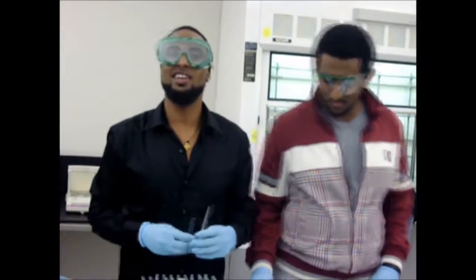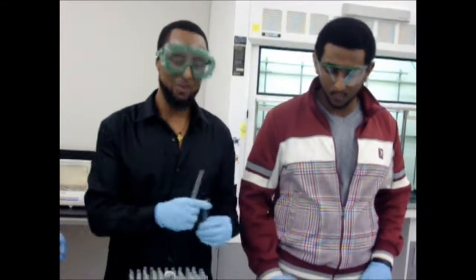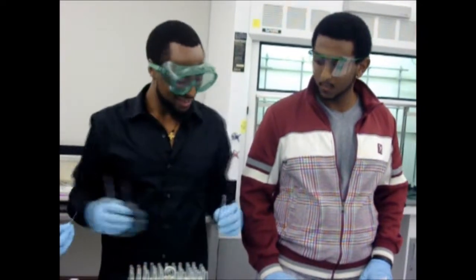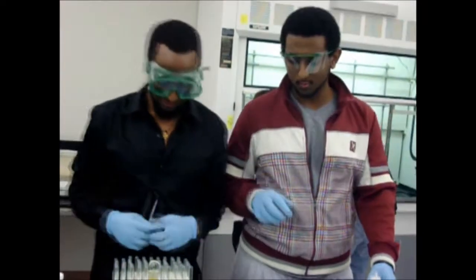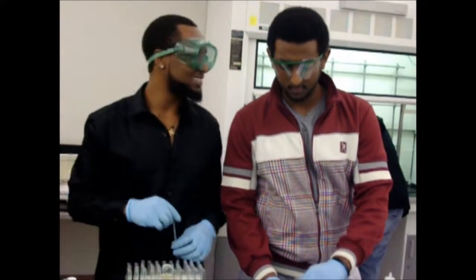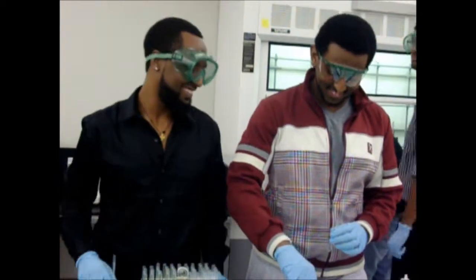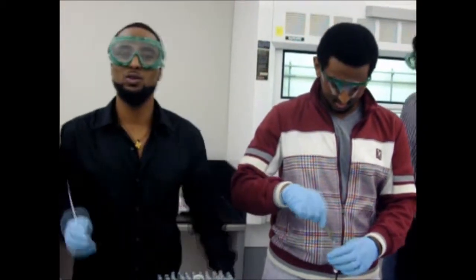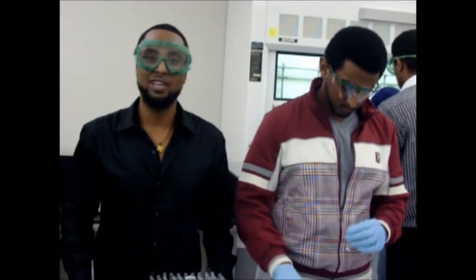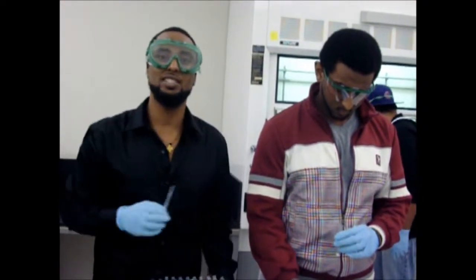Hello everyone, the very next test that we will perform is the HCl test with our product lidocaine. Now, if you can please pour me some lidocaine in here, sir. Just to go through what we're about to do, we're going to get a test tube full of lidocaine, put some distilled deionized water so we can test the pH.